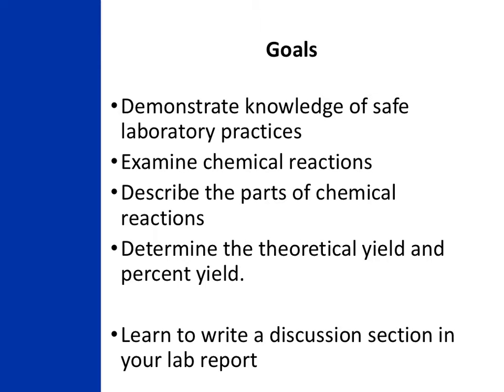We are going to be working with some hazardous substances, so it's important that you pay attention to any kind of hazard warnings that are given to you in your procedure.